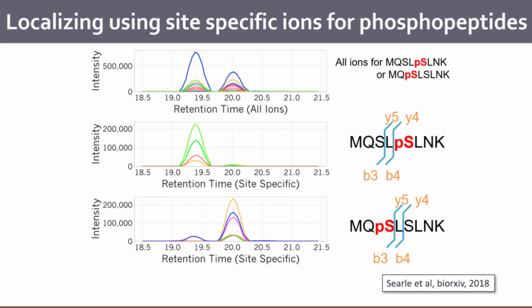So this is an advantage of data-independent acquisition or parallel reaction monitoring. In fact, Brian started to see these things earliest by doing parallel reaction monitoring. When he started to measure a specific analyte, you notice a lot of the peaks actually had multiple retention times. I often see it in these figures, you have this small bump.